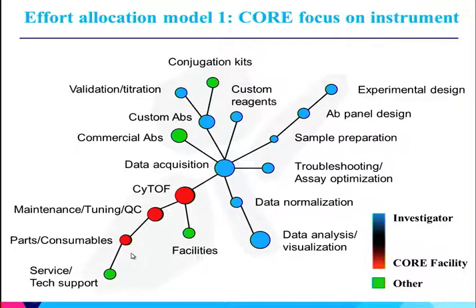And in order to have a good sample or project workflow, you need to have everything on hand to regularly keep things running well, including argon. The machine essentially feeds on argon, and having an argon tank run out in the middle of an experiment is the worst. So it's really getting a good sense of how your inventory changes over time and how to keep everything in place to allow things to move along. So this is not trivial.